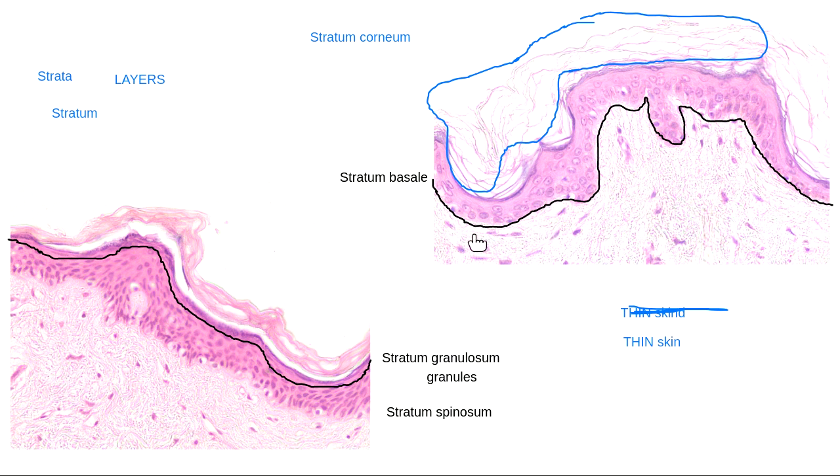See down here how we're definitely not in epithelial tissue anymore. I've only got cells that are spaced out a little bit. All these little guys are cells. This was that place, by the way. Let me get my typer. Areolar loose connective tissue.